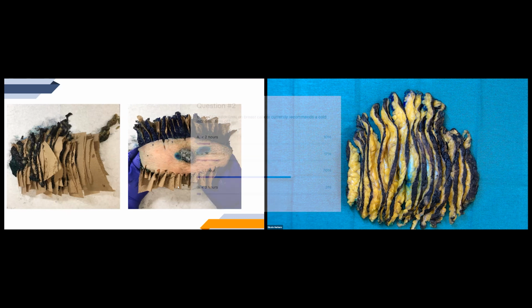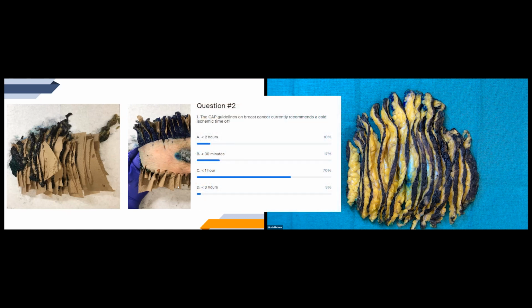And here are the results. So it looks like most people did get it correct. So it is in fact less than 1 hour. Cold ischemic time is the time that tissue is removed from the patient and then placed into formalin.